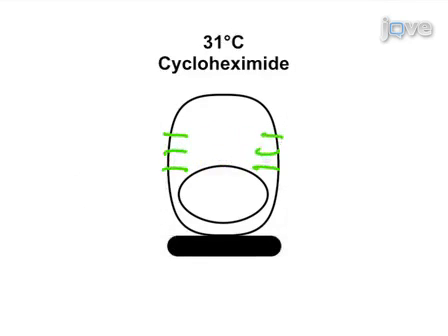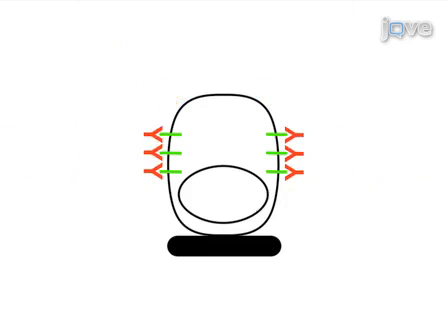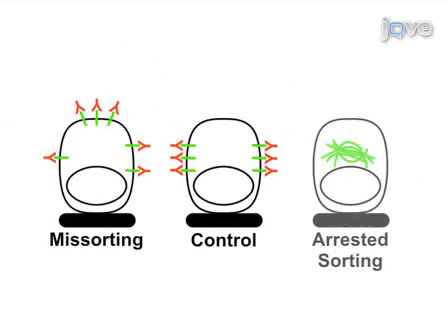Proceed to chase the reporter protein to the cell surface in the presence of cycloheximide to prevent further protein synthesis. Finally, label the reporter protein at the cell surface for immunofluorescence analysis. Results obtained from this assay permit visualization of the change in surface localization through confocal microscopy.